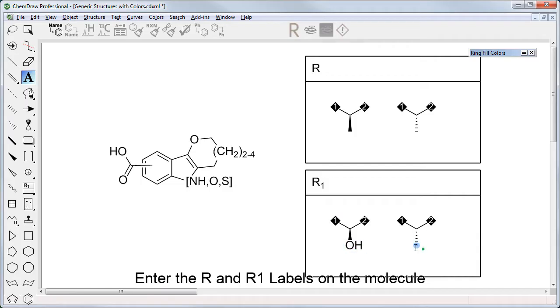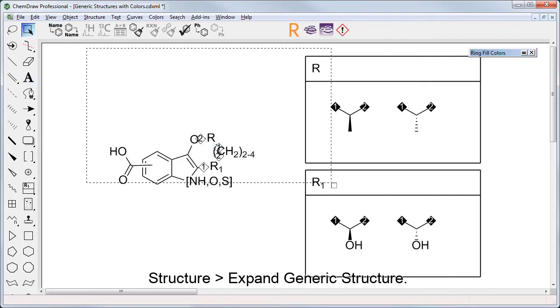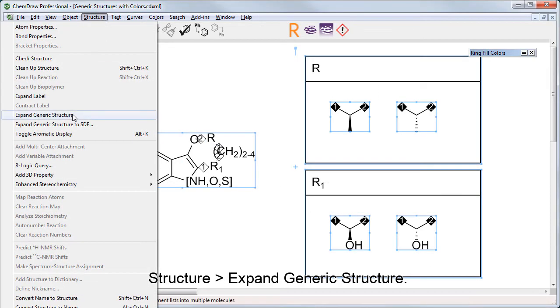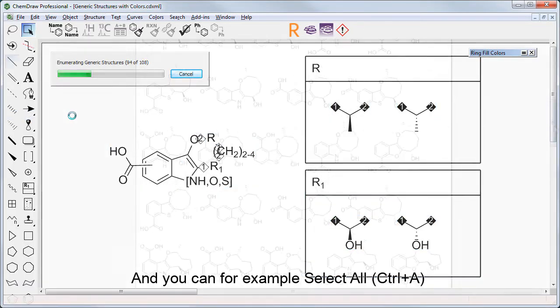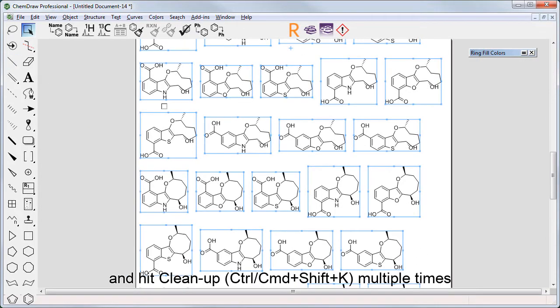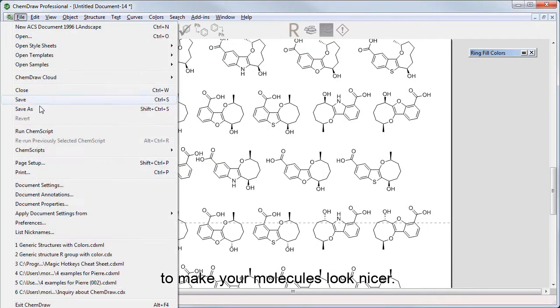You enter the R and R1 labels on the molecule. You select Molecule and Tables, Structure, Expand Generic Structure, and then you can, for example, select All, Ctrl-A, and hit Cleanup multiple times to make your molecules look nicer.